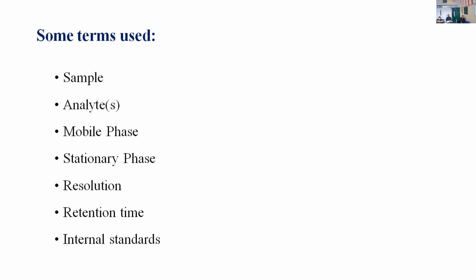Resolution is the degree of separation between two adjacent peaks. The greater the difference between two adjacent peaks, the greater the resolution, and the smaller the difference in time, the lower the resolution. Retention time is the time taken by an analyte to get eluted from the column.